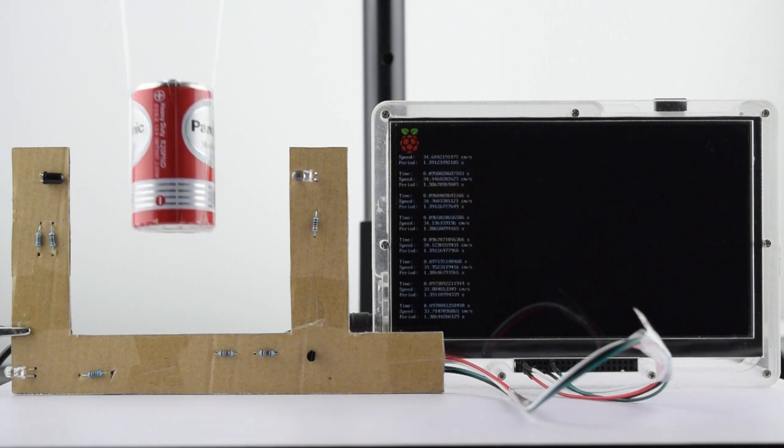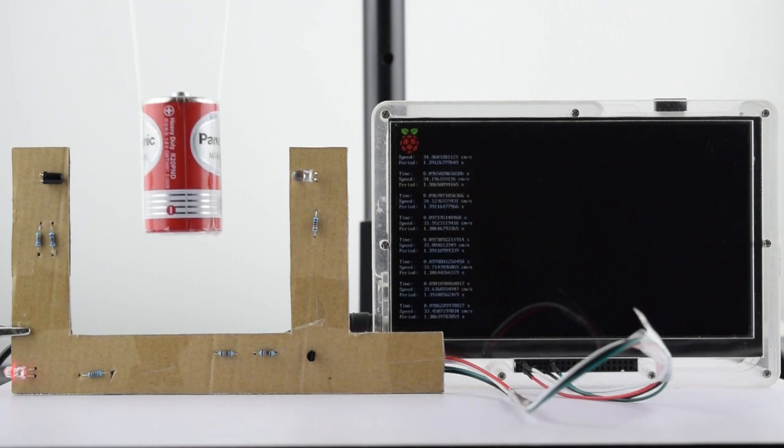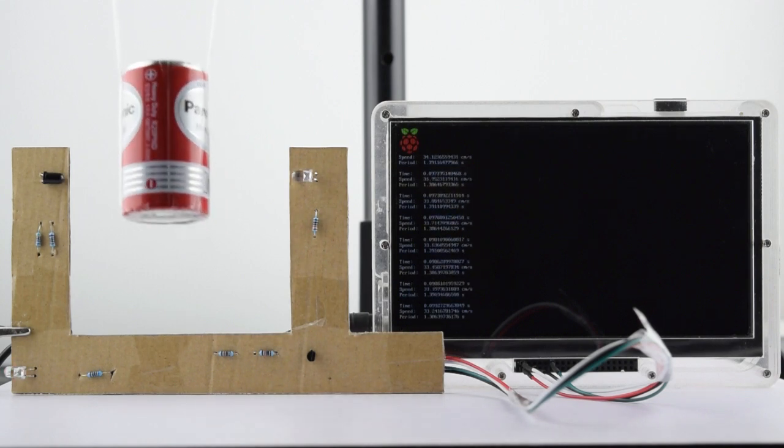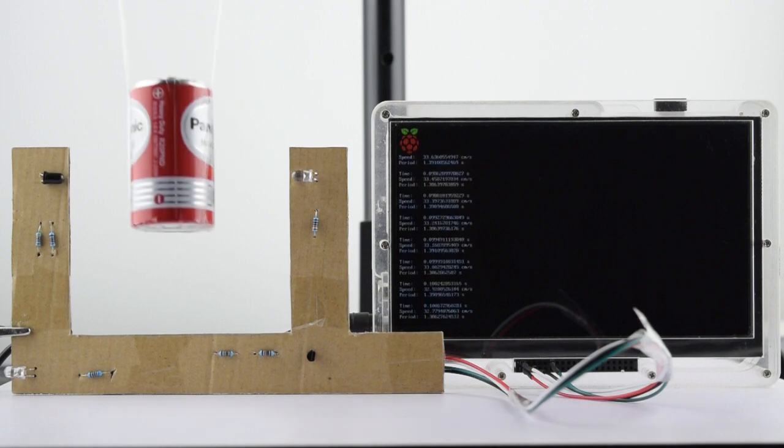They aren't cheap to buy, but in this video, I'll show you how to build one from simple circuit components that you can interface with the Raspberry Pi.